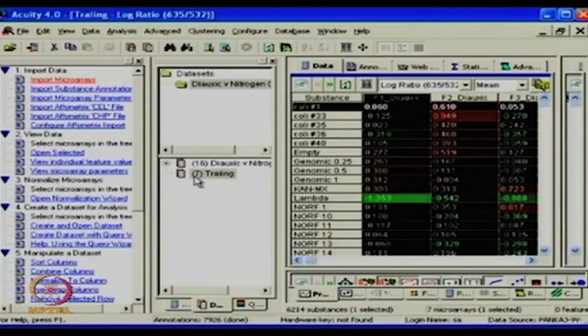So here you go. From the 7 microarrays you have got, you have all the data available. Now this is the one to get all complete data. You can also have other ways, as you suggested, with p-value importance coming in or log fold change values coming in. You can define criteria for doing that. The way to do that, again, look at the common task pane. We have done the 3 steps, and now after doing normalization, I can click on create and open data sets.